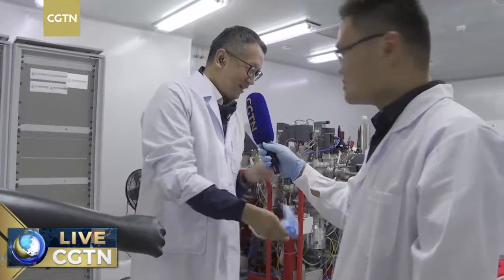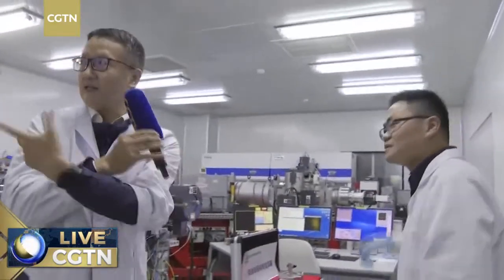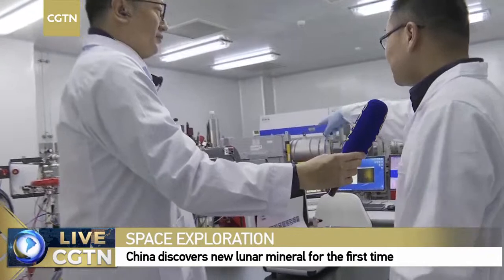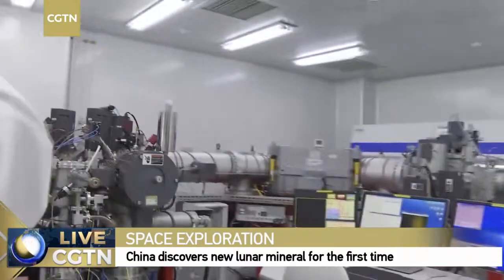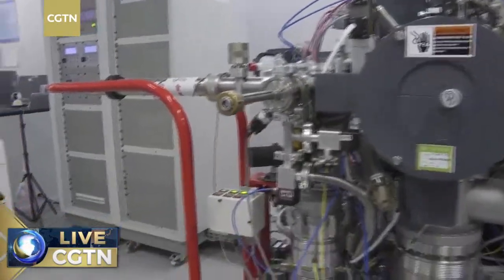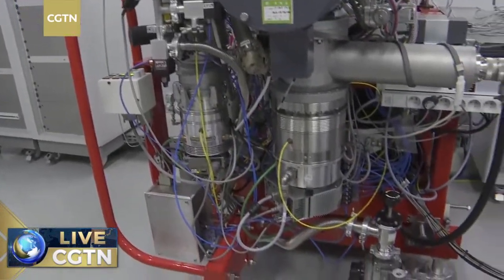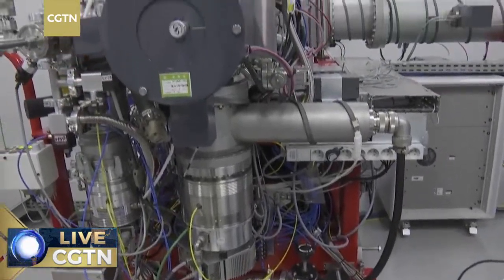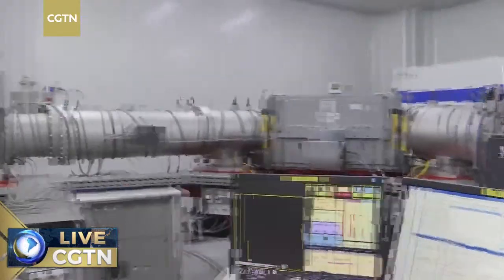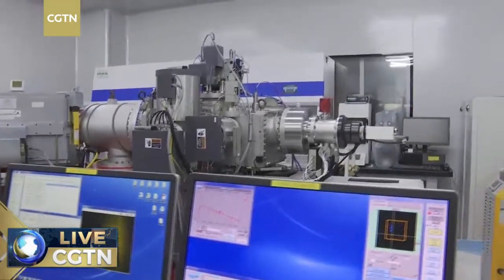Okay, and can you tell us something else about this laboratory besides the glove box? What other devices do you usually operate? Yes, of course. 这个就是我们的这个叫二次离子质谱仪。 Is there an English name? Because this word sounds really complicated. Yes. 然后呢，它就是我们刚刚已经介绍了，它主要是做一些很微小的这个元素跟同位素的这样一个分析。 So this huge complicated device does analysis on the elements, very small particles of the elements. And this is the operating room with the computers and other devices. This is really, really special.